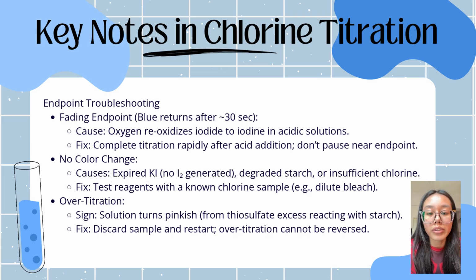Third one is over-titration. Sign: the solution turns pinkish from thiosulfate excess reacting with starch. Fix: discard the sample and restart. Over-titration cannot be reversed.